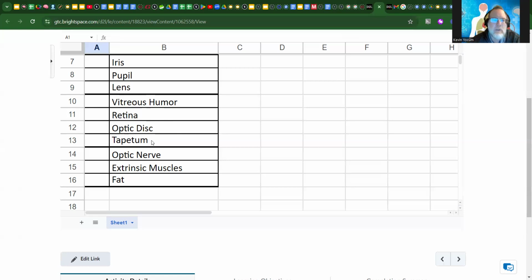And then we'll also notice, when we remove the vitreous humor and the retina, the optic disc as well as what's called the tapetum, and that's going to be unique. It's like a fingerprint from the animal. So every single cow eyeball is going to have a little bit different look to the tapetum, which is really pretty. It looks almost like the inside of a shell.